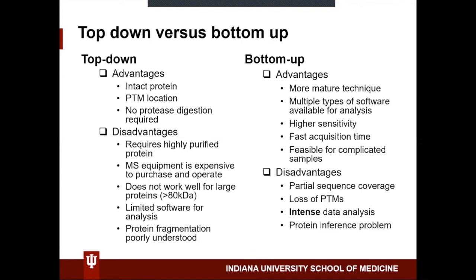And so it's a challenge for actually all of these, and we do spend a lot of time in the core working with people on their purification methods, partially because that is really a requirement for certain types of mass spectrometry data, especially for things like full coverage post-translational modification mapping, which is something that we work on quite often. So just thought I'd mention that. Yeah, absolutely.